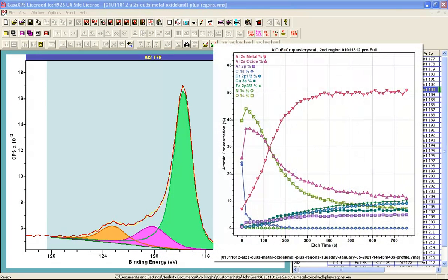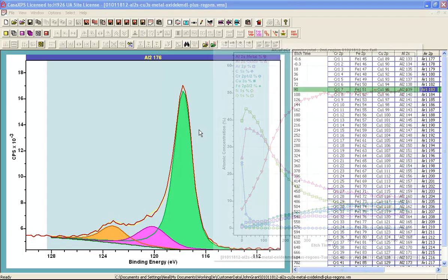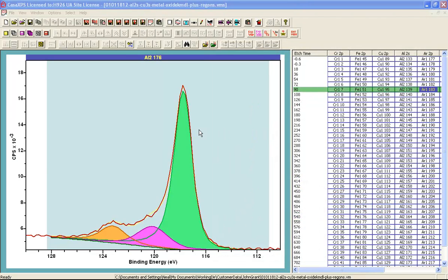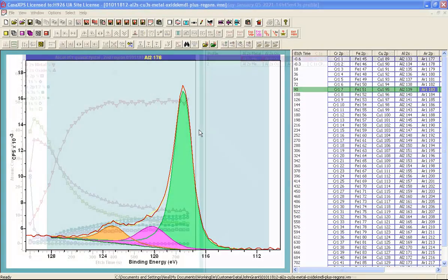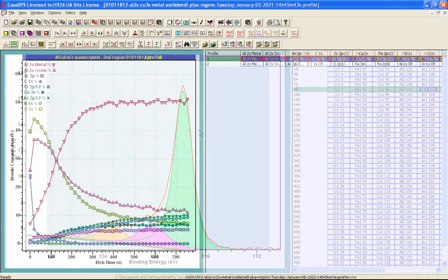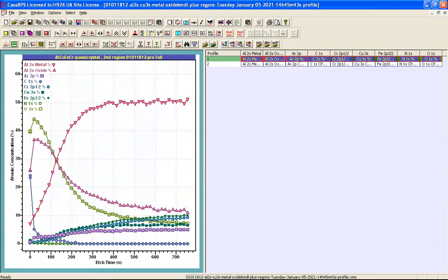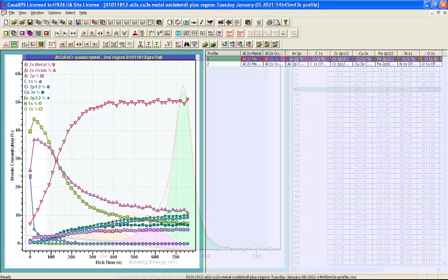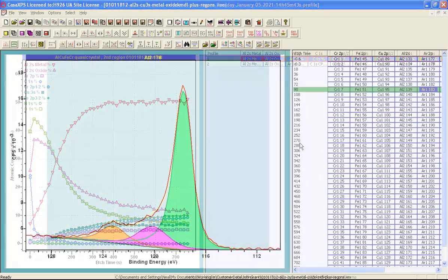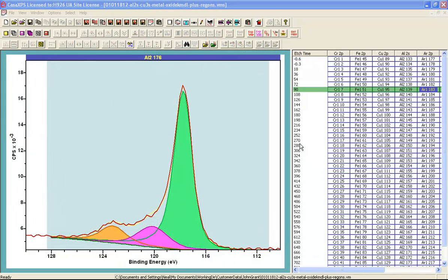The profile is calculated from these regions and components and then presented as a VAMAS file that is a set of percentage concentration traces as a function of the etch time or the depth if we calibrated the etch time to depth scale.